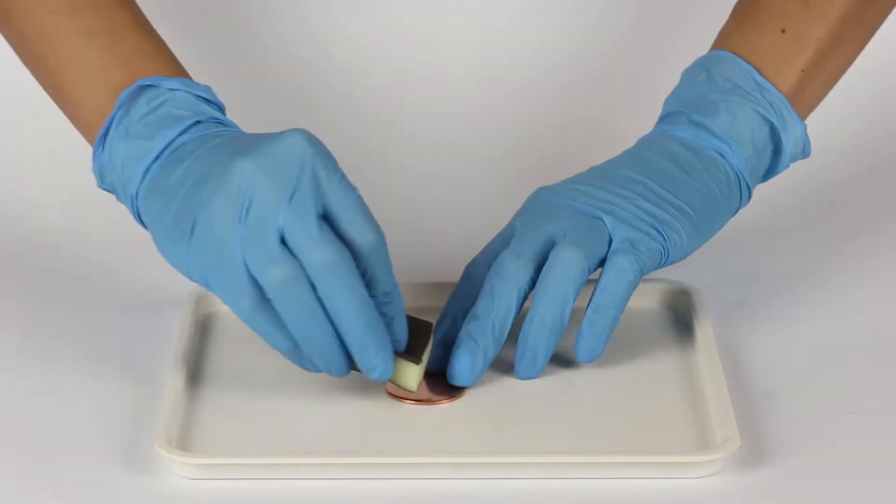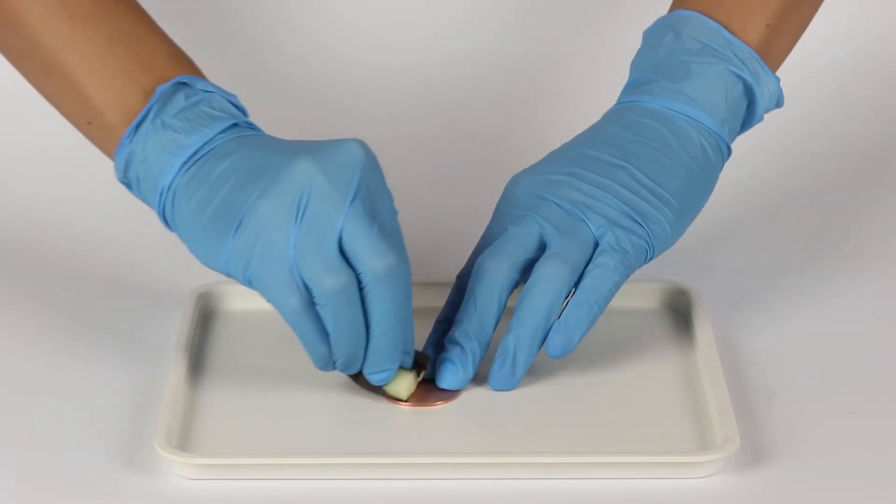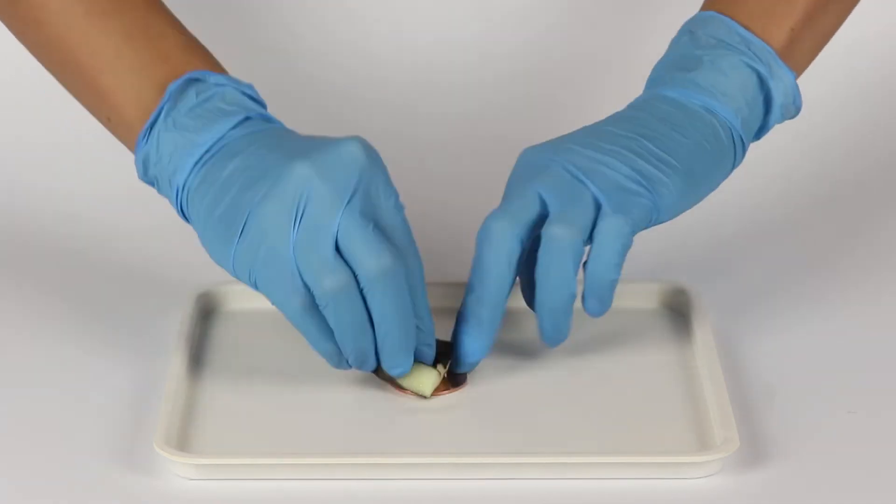Rub the surface of the copper disc with the abrasive sponge to remove any impurities, which may prevent electroplating.